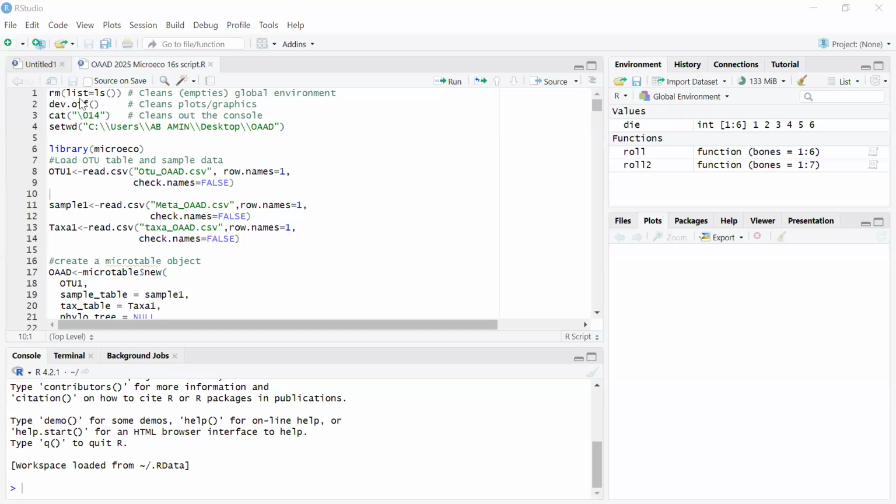Okay, so can you see my screen? I think it is trying to come up. Yes. Yeah, Okay. we can see your R Studio screen.